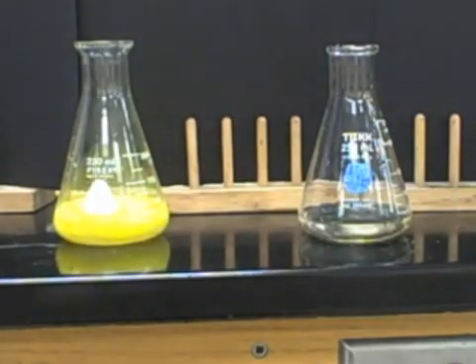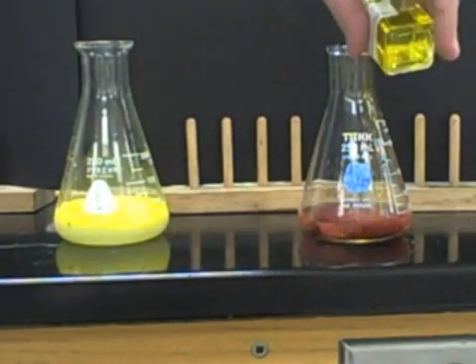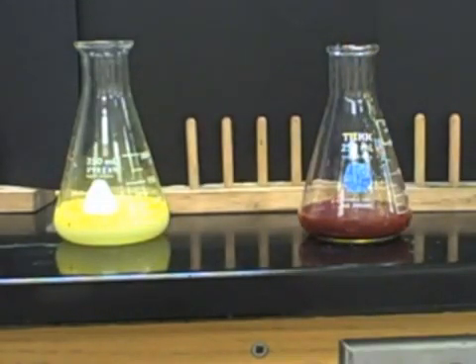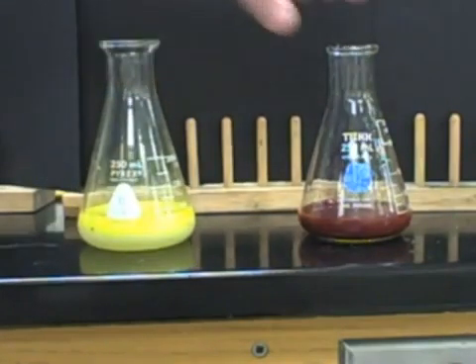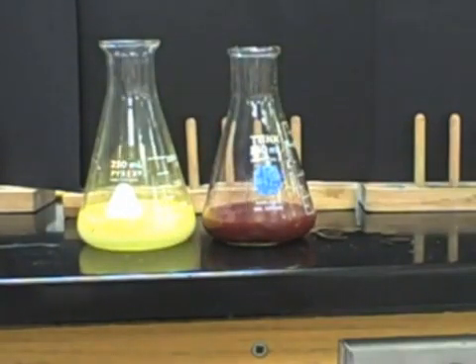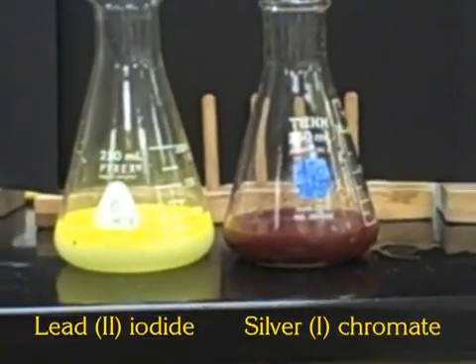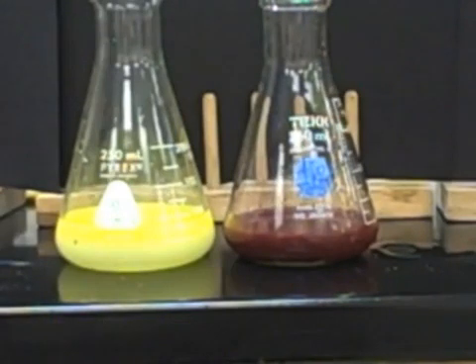That's amazing. And then we're going to add our yellow potassium chromate to our silver nitrate for a blood red precipitate there. That's also amazing. So you can see here is lead 2 iodide and silver 1 chromate. You can see those are both amazing reactions there. Iodide and the chromate. So that's our precipitates video.